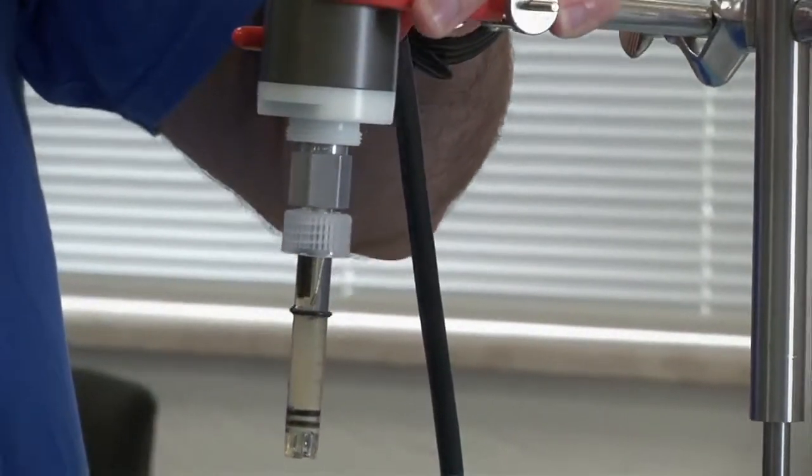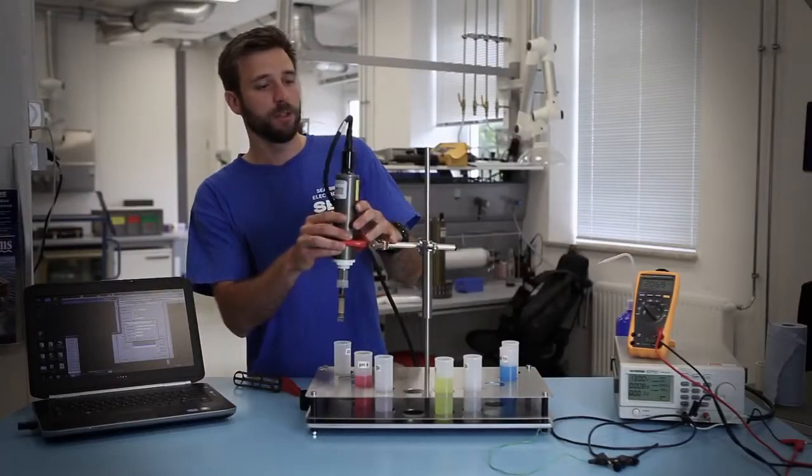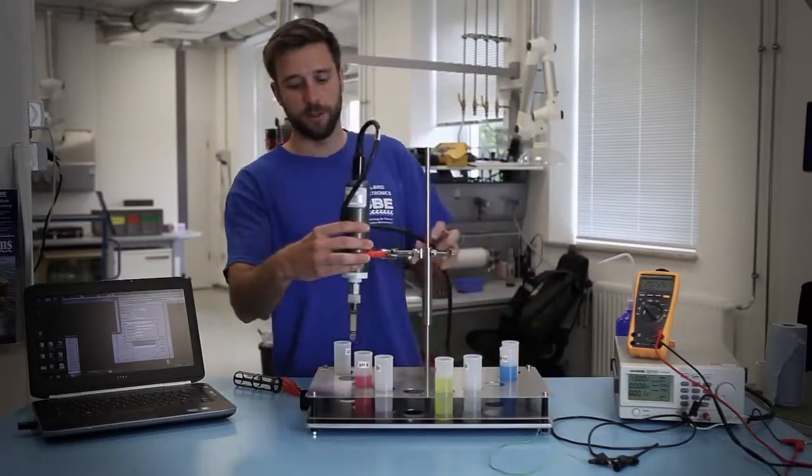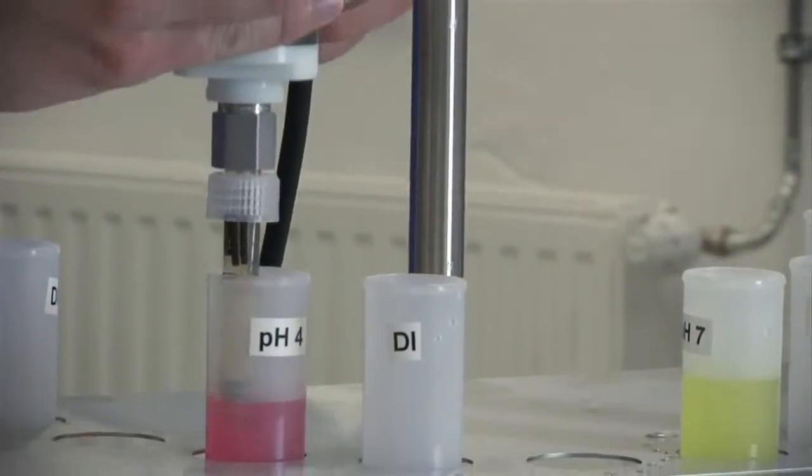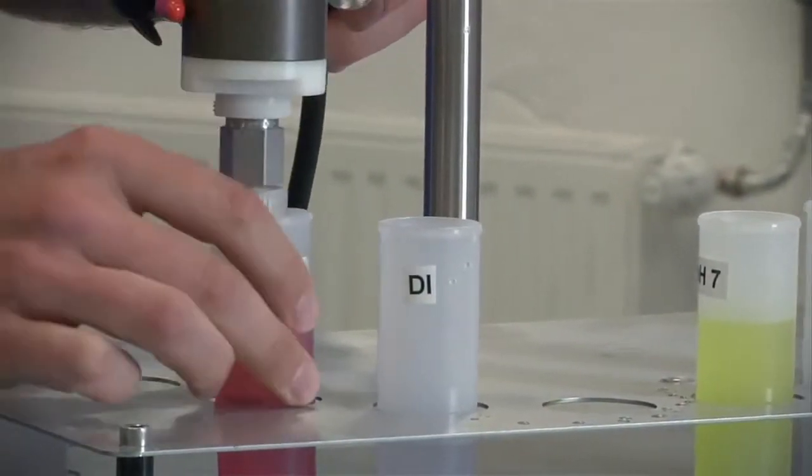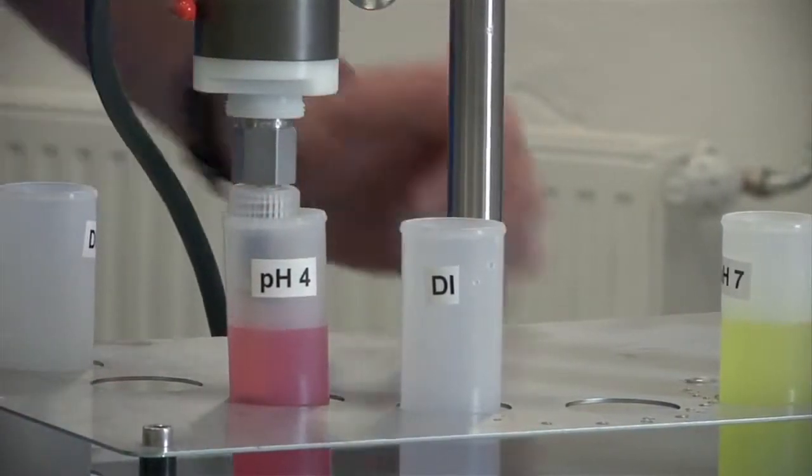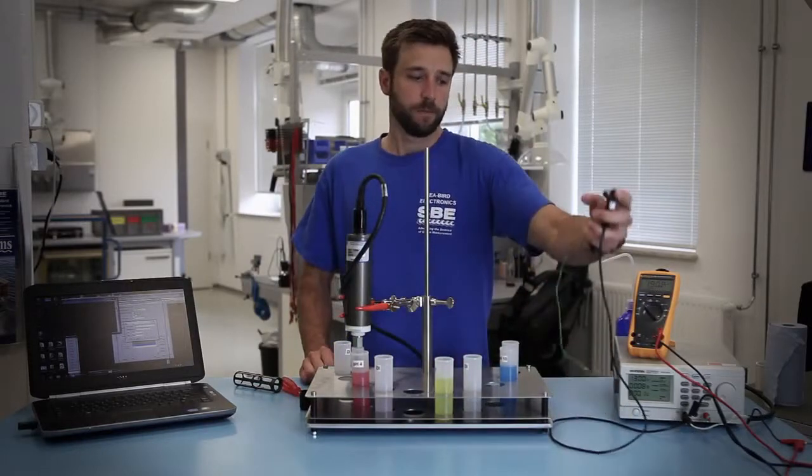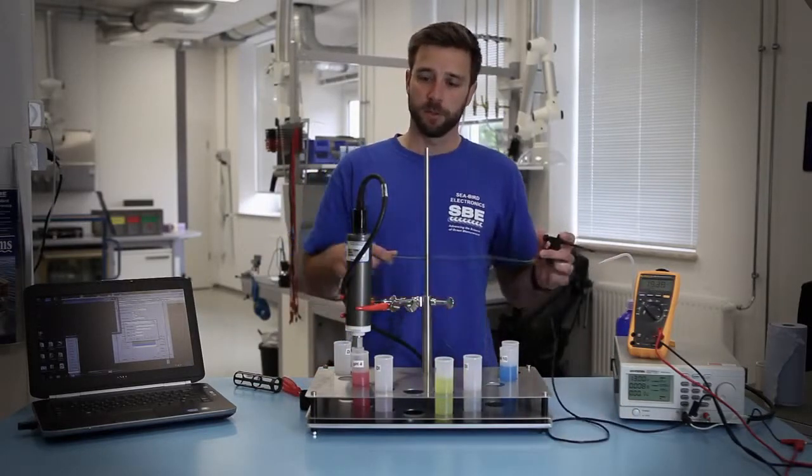So when we first do this, we want to supply power to the pH sensor. The power supply is on and we'll place it in our first solution, pH buffer solution 4. Once it's in there you want to make sure that you have the instrument grounded into the solution.